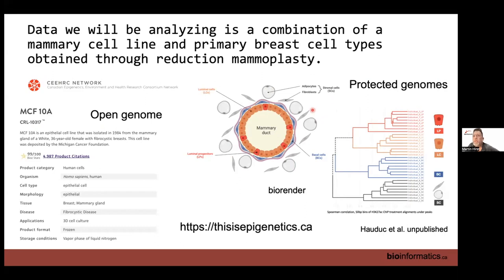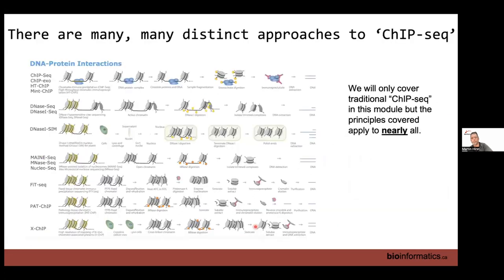file. So this is a reduced representation, or a transformation, of the data sets that allows for comparative analysis. And if you're interested in learning more about this work and the Canadian consortium that's driving it, please go to this website here.